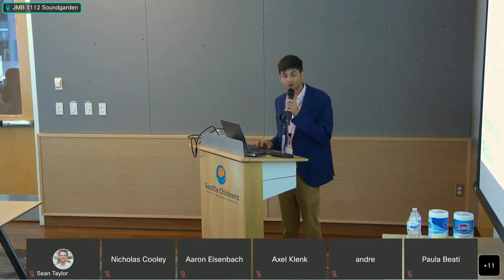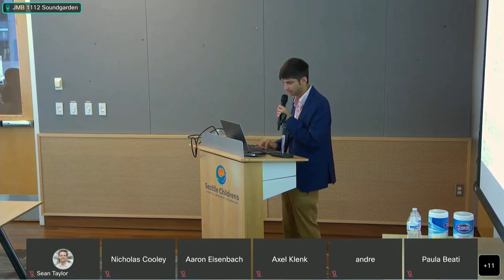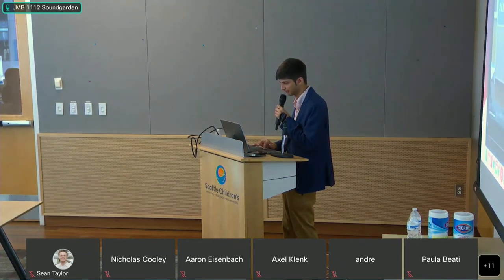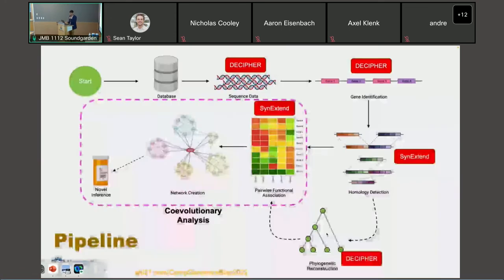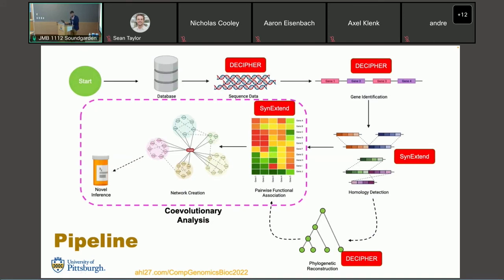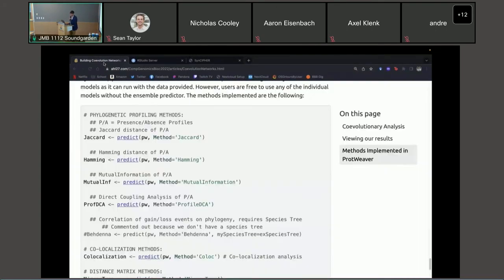Since we have extra time, let me showcase what a workflow looks like for building trees. I just came from a workshop dedicated to learning this pipeline using IQTree and Prodigal for gene finding — it took an extremely long time to get all the code downloaded and running. In our pipeline, once you have sequences read into R using Biostrings, it takes two lines: just align them with AlignSeqs or AlignTranslation, then run TreeLine — also a new method — and it makes a tree. That's all it takes, still in R, and you get back a dendrogram object you can plot.